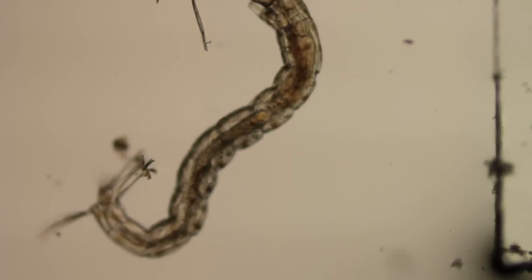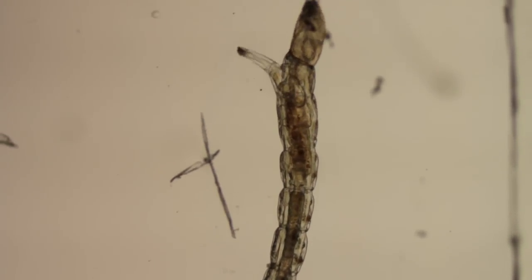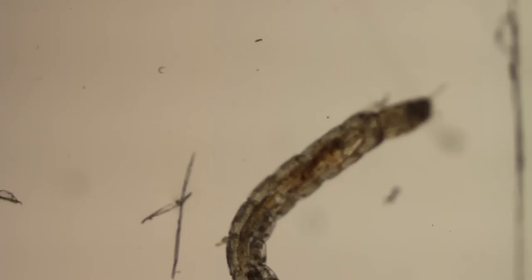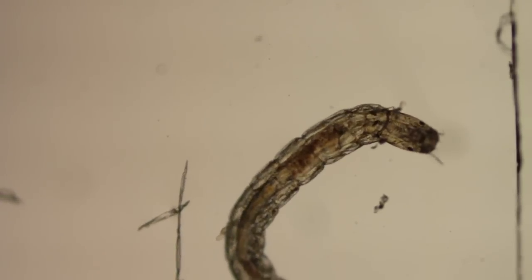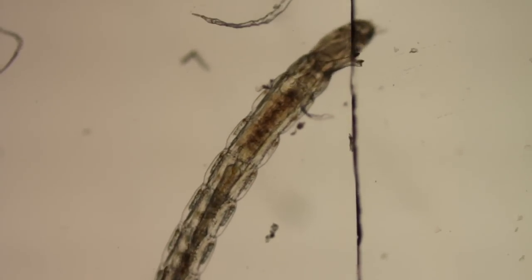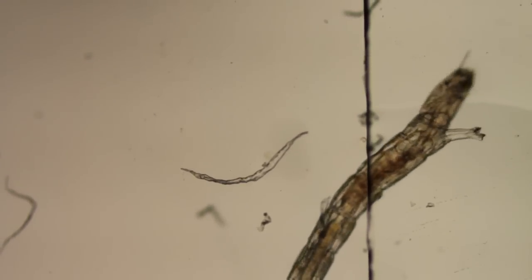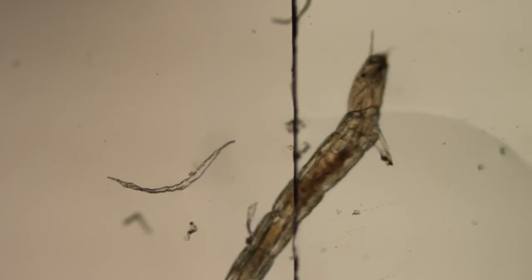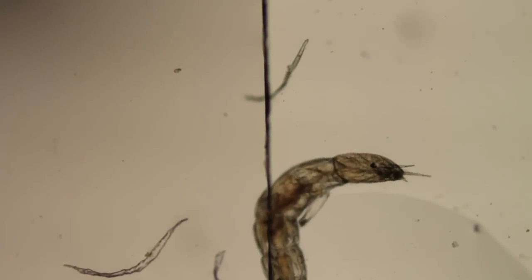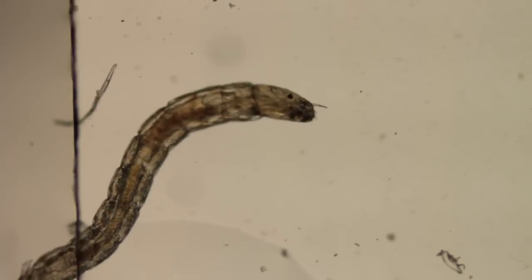You can see he's got little arms that he can use to pull himself along and walk. He's on the downside — on the slide. See, he used them on the edge of the cover slip there. He can't get a good purchase on the glass of the slide though; I guess it's too slippery. So he kind of pushes himself along with his tail and helps with those arms.